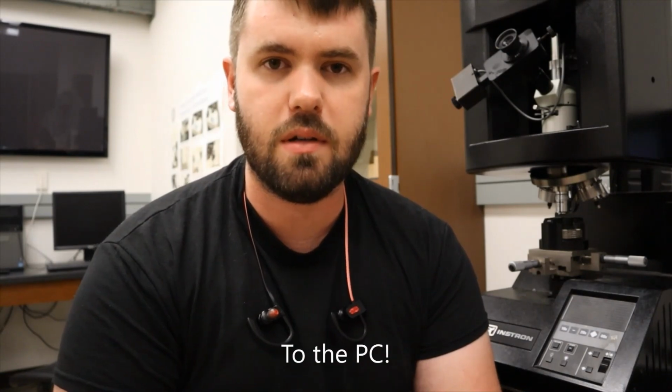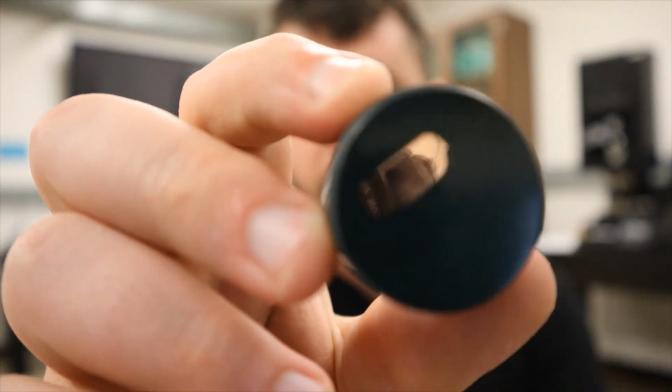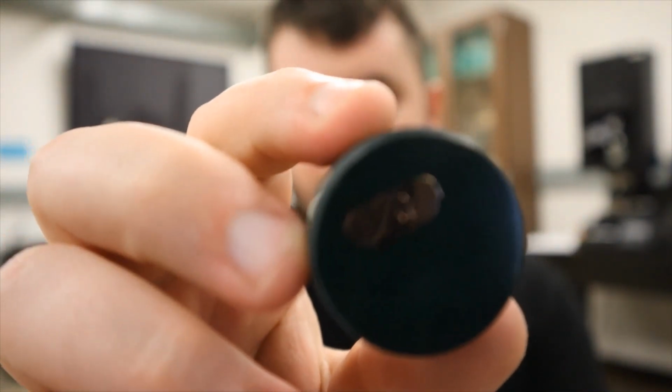So let's go over to the computer. So I have chosen 4 unknown copper silver samples. They all look something like this. You see they're a little beat up. They have some scratches on them from older semesters, but I have repolished them a little bit, so hopefully we can see the microstructure fairly easily.